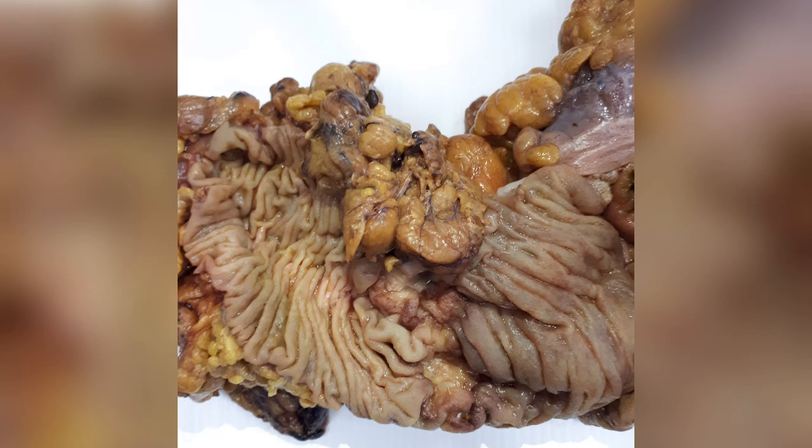This photo shows ulcerated lesions. What you need to describe is the ulcer. You need to include the description about the margin of the ulcer, the edge of the ulcer, and the floor of the ulcer. Sometimes from the gross description we can determine whether the ulcer is benign or malignant. You can see that from the example I used, I have described the main pathology of the specimen and used proper medical terms, which are the edge, the margin, and also the floor of the ulcers.